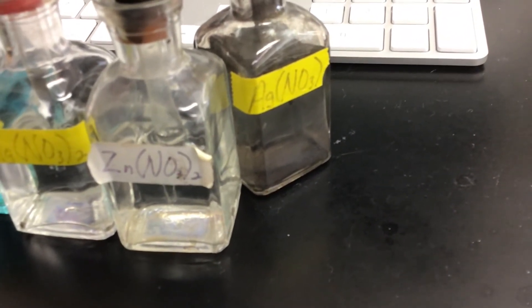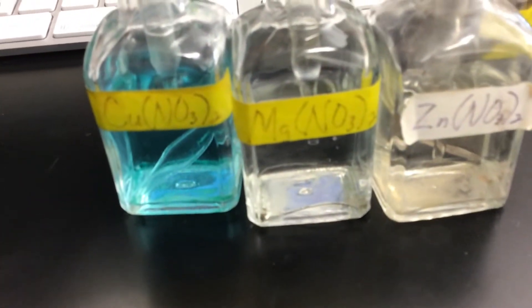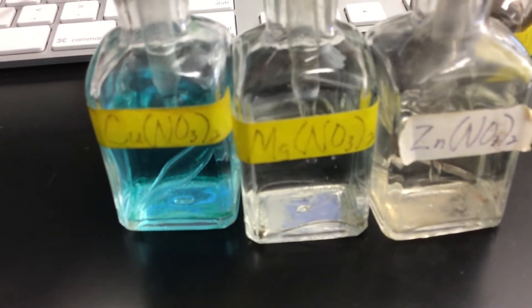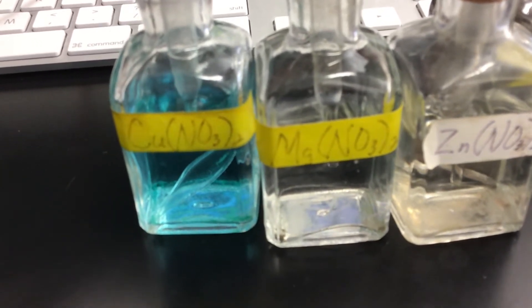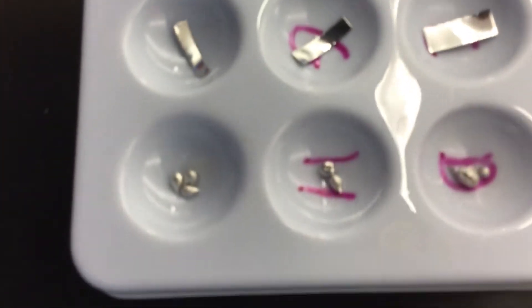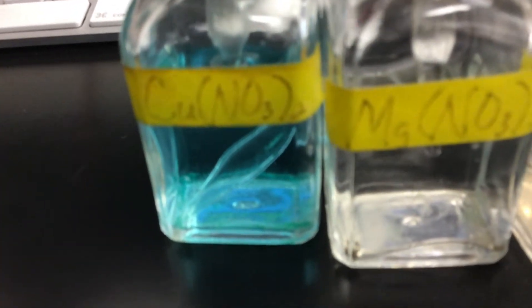With a single replacement reaction, these ions are like a couple — copper is bonded to the nitrate. What we want to see is whether copper gets knocked out of that bond, and whether magnesium, zinc, or tin will become the new partner and bond with the nitrate instead.